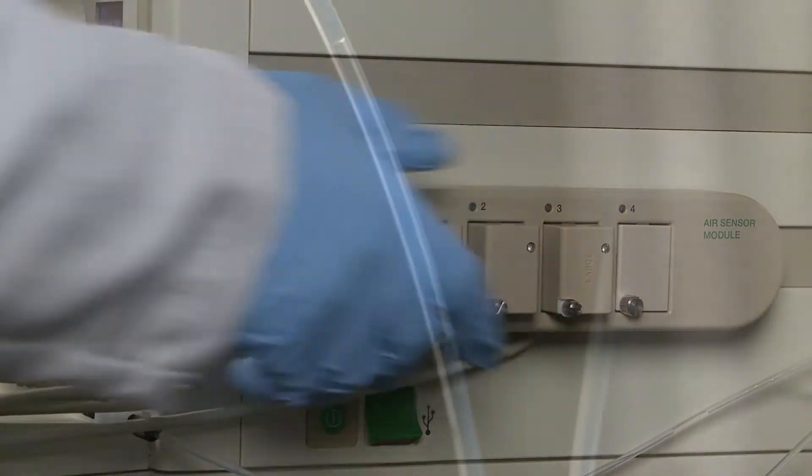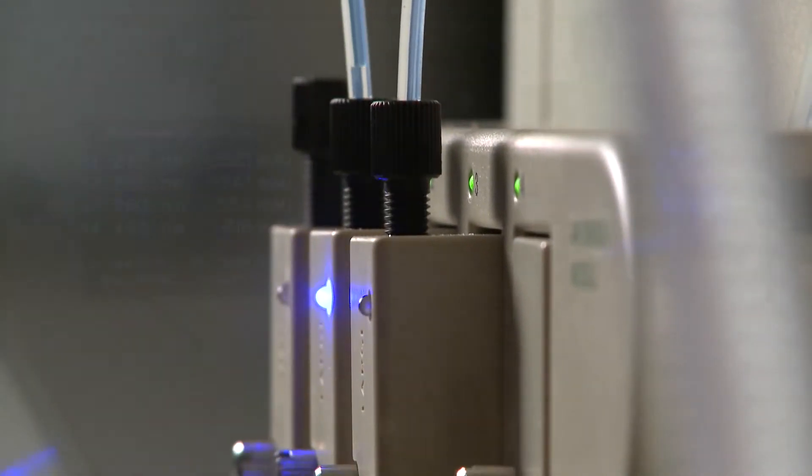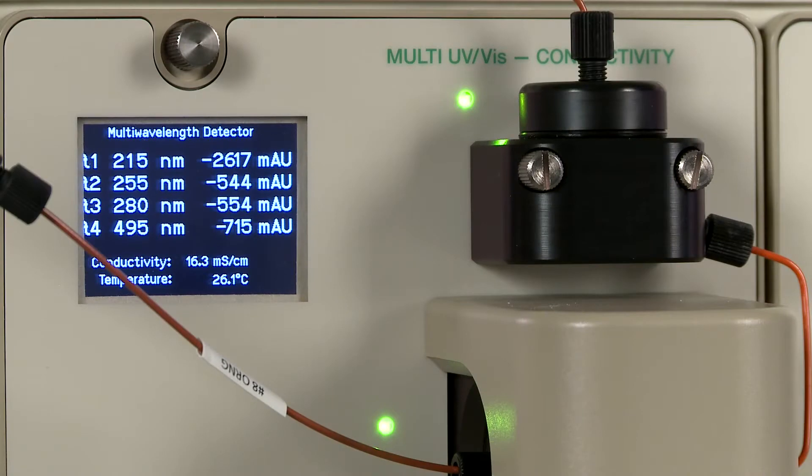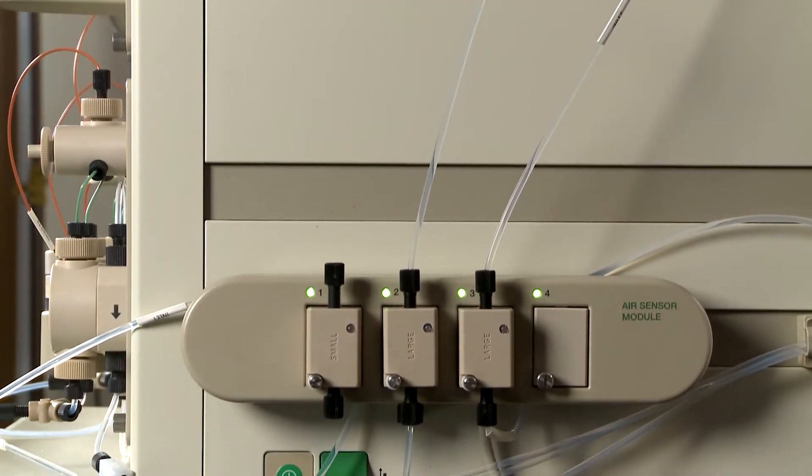Installing an air sensor module on your NGC will allow the system to automatically detect an end of buffer or end of sample event and then stop the sample pump or proceed to the next program step, preventing the introduction of air into the system. When running chromatography applications, the introduction of air into your buffer lines can result in damage to a column and loss of precious sample.